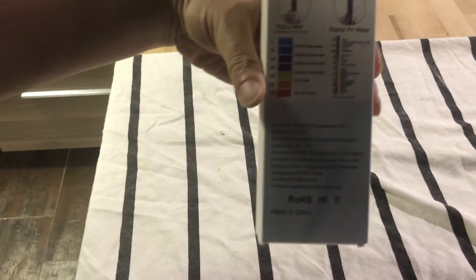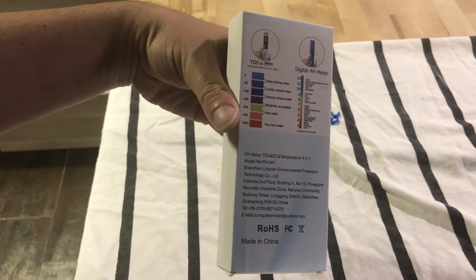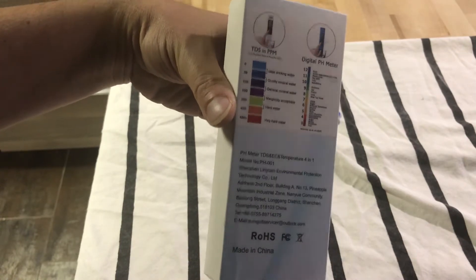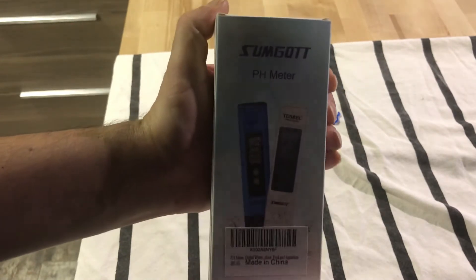Here's the back of it — there you go, that's better. That's the back of it, and then that's the front of it. Let's open it up and see what we got.